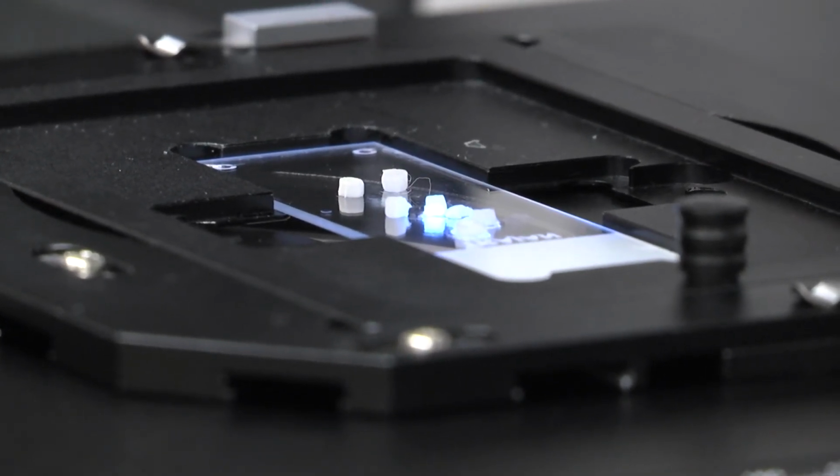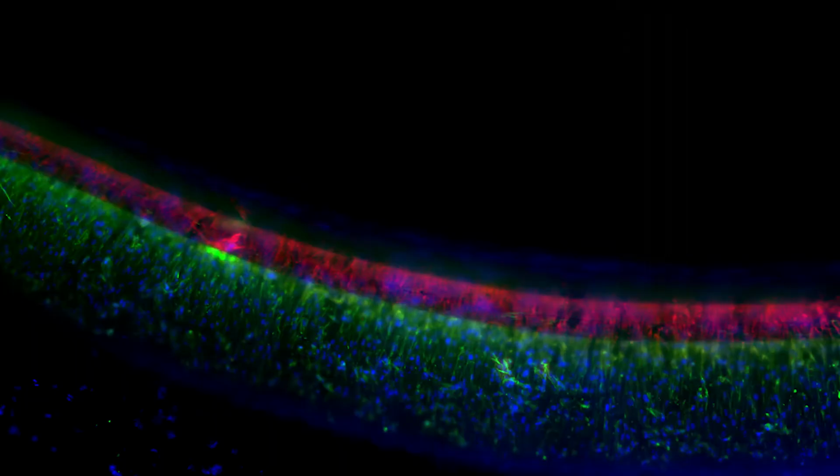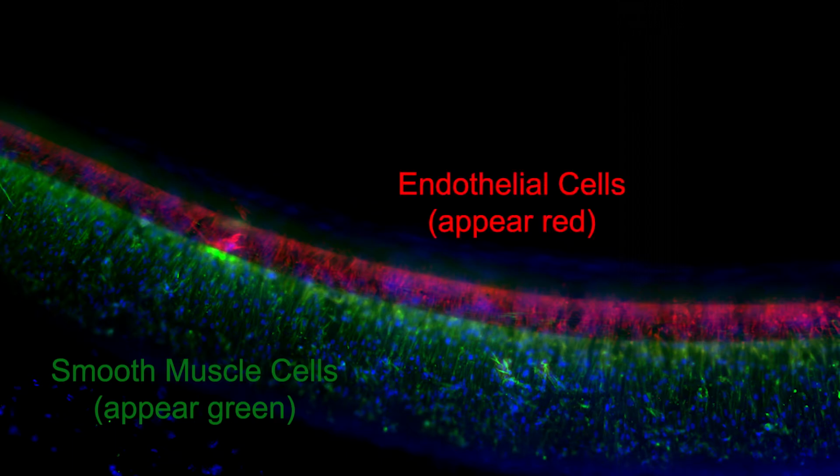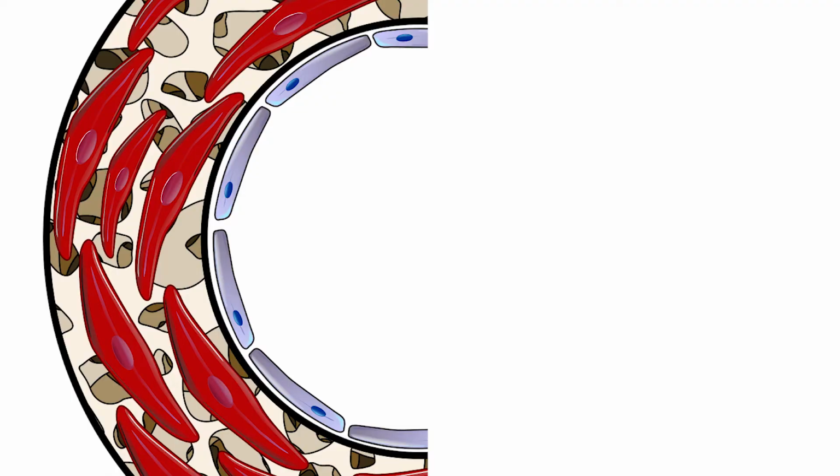I touched on this picture in the lectures, but you can really clearly see smooth muscle cells in the wall of the graft, just as the biology suggests. And then on top of that, the really clear endothelial cell layer. So it's a much more advanced way of doing it than just tissue culture plastic. That allows us to study crosstalk between those two cells. It allows us to study response to injury. One of the things we're interested in is injuring that endothelial layer and then seeing it recover, so asking some specific biological questions around how it behaves in an in vitro model.